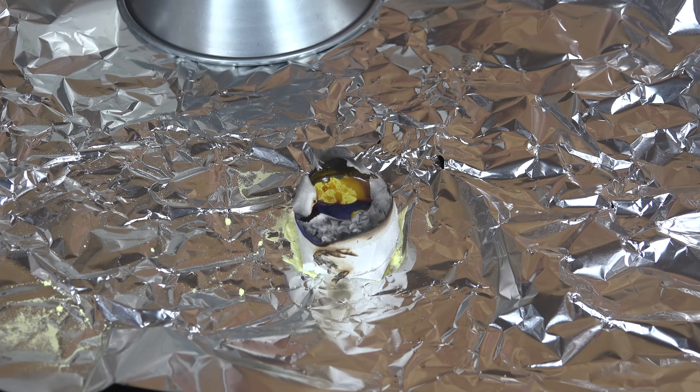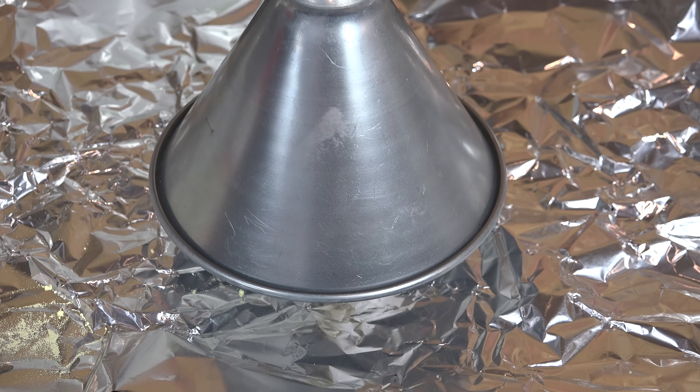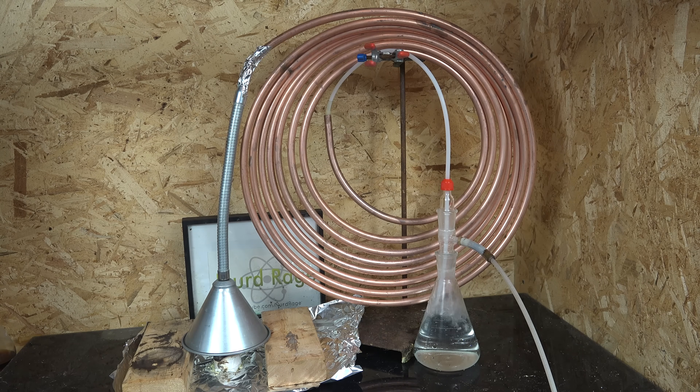We need to build a gas capture setup. We start with a metal funnel over the burning sulfur and connect a long coil of copper tubing using some aluminum duct tape. The copper tubing is to cool the hot sulfur dioxide gas that just came off the candle. You actually don't need this much tubing — I found the gas efficiently cooled after just two meters of tubing, or about six feet. I was just too lazy to cut my tubing down.